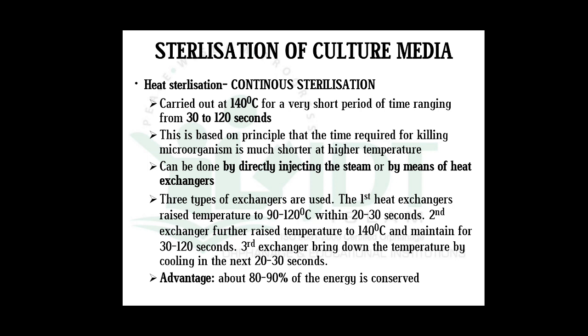Now, what are the advantages? About 80 to 90 percent of energy is conserved because it will take only a few seconds, like 30 to 120 seconds, for the total process of continuous sterilization, and we can sterilize the culture media continuously, one after another. So that is the heat sterilization process.